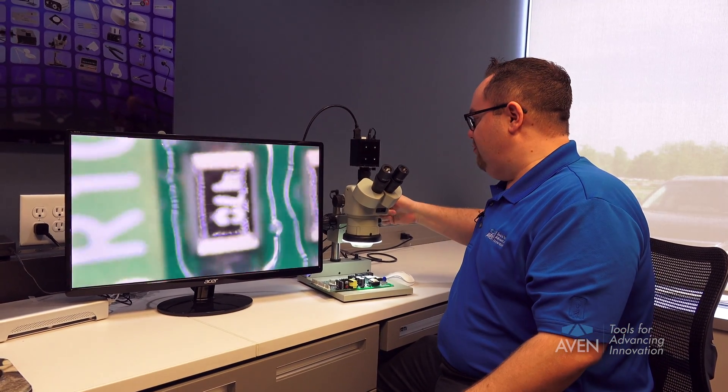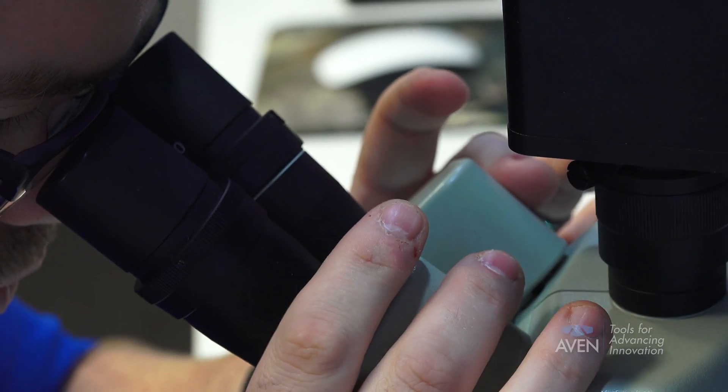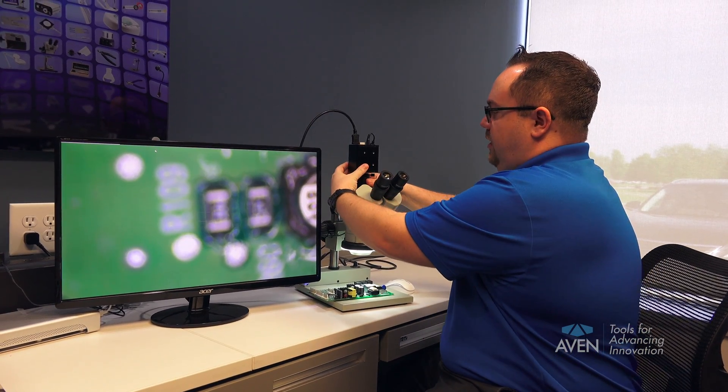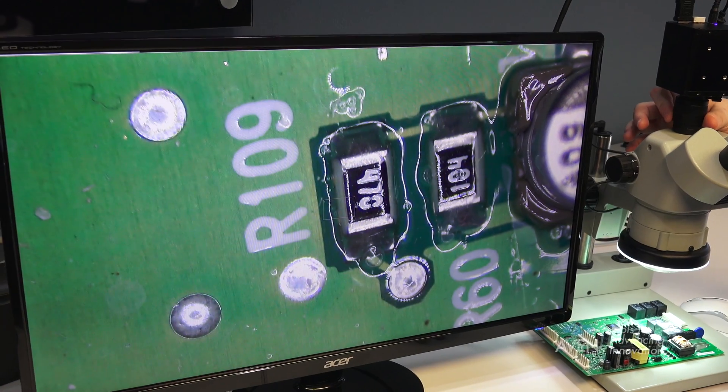At the lowest magnification, adjust the eyepieces for size so they're clear. Finally, adjust the camera collar so that on screen you're in focus.